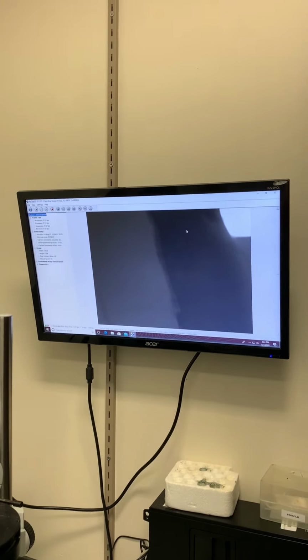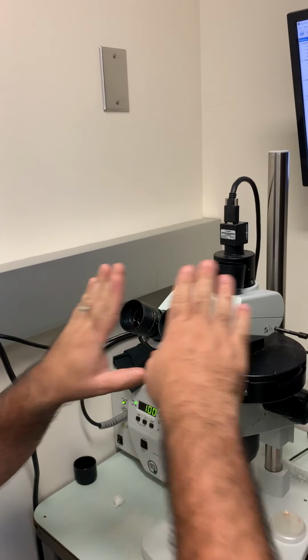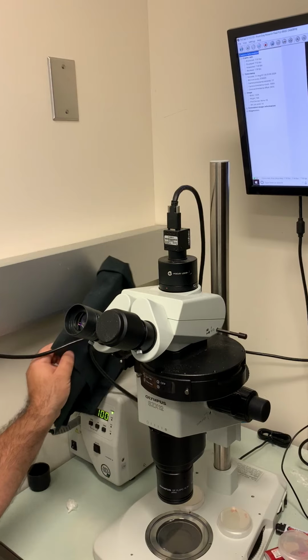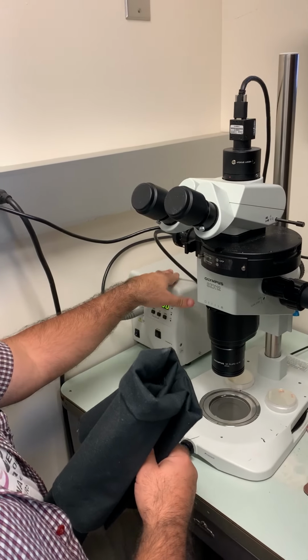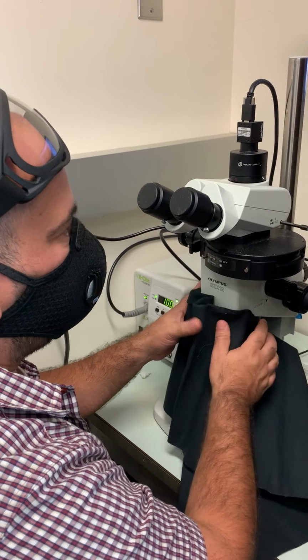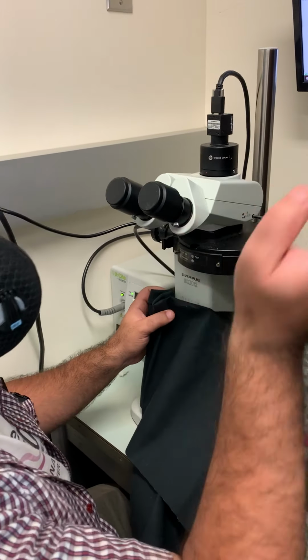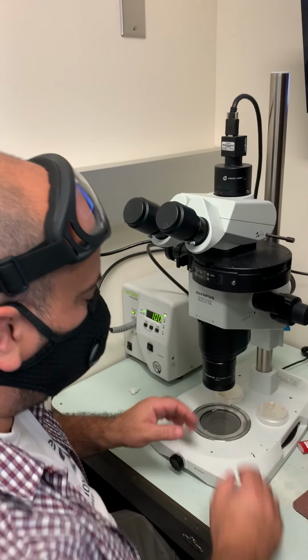I want you to notice that there is a white rectangle here. That's the fluorescent light bulbs up above you, and so you don't want that light to enter the image. It's entering through the eyepieces right now, so you can cover the eyepiece. And we got a piece of fabric here, which should not be on top of this thing because it gets hot. When you're filming, you can fix this around to minimize the amount of light from the outside environment that is entering into the plate.